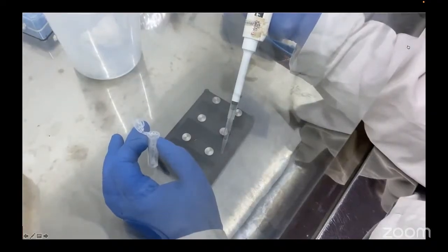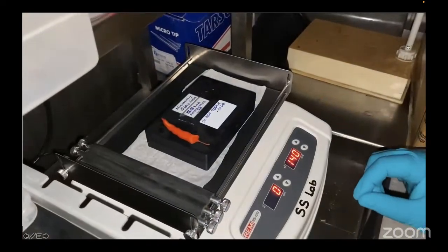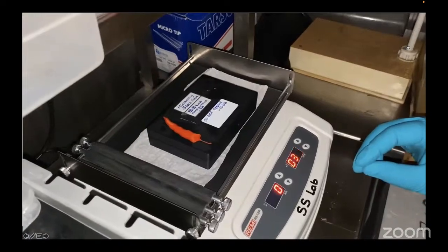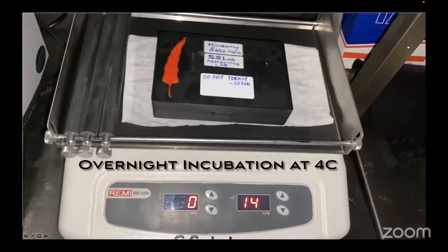This will be done in a cold room at 4 degrees Celsius at 140 RPM on an orbital shaker.